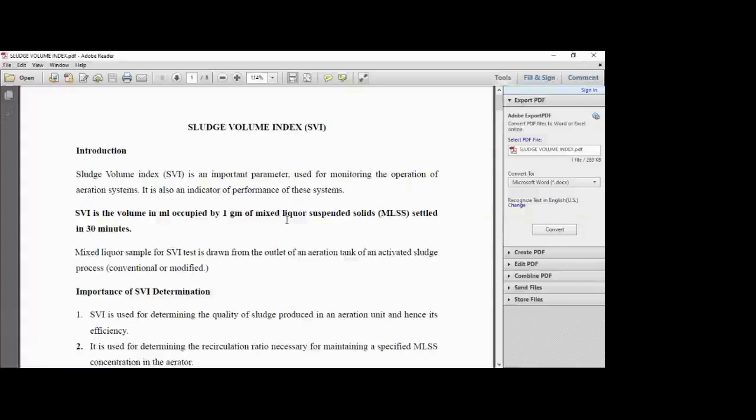right? So a few of the very important terms we are going to see are ones you can highlight and try to remember, and this is the type of answer we need to give when that question is asked. So what is a sludge volume index?